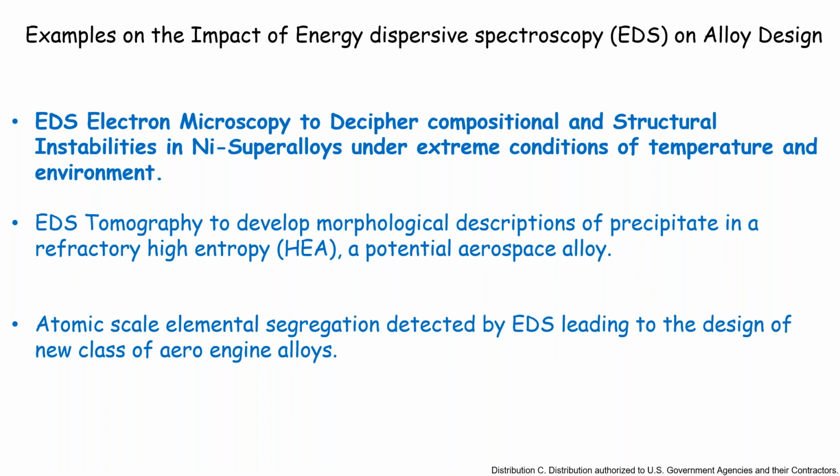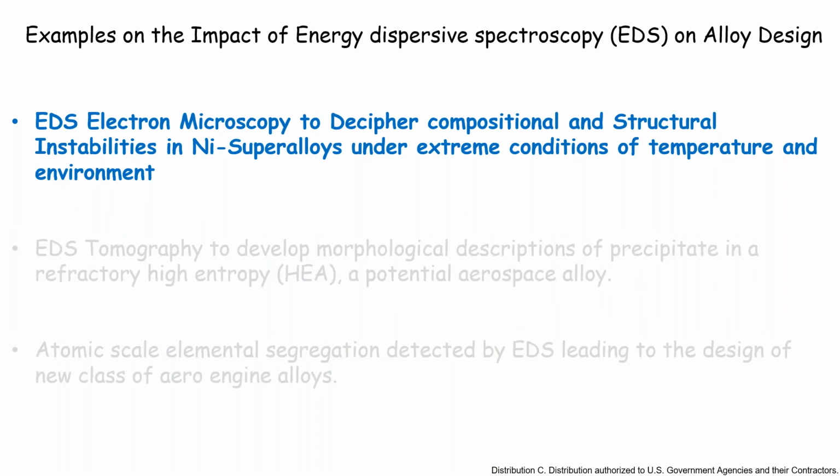All this work was done at Ohio State in CEMAS, with the help of the EDAX detectors and other EDS techniques that we have here. So let's go to the first topic.